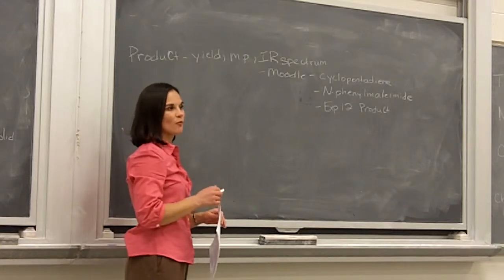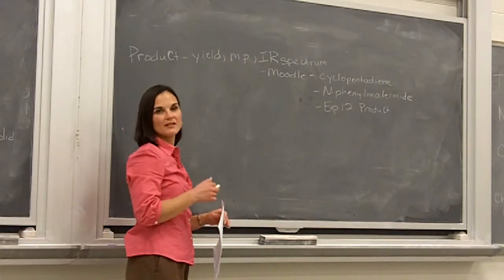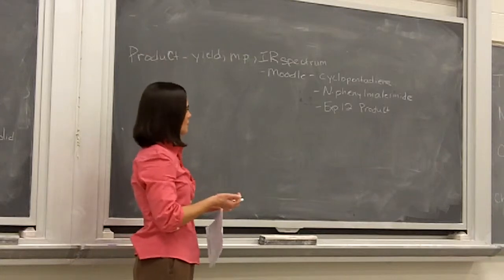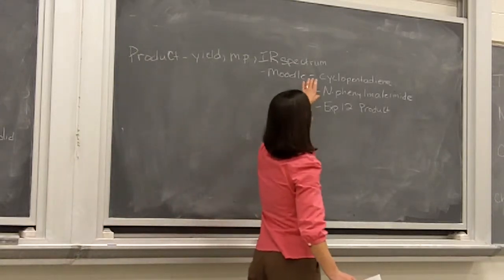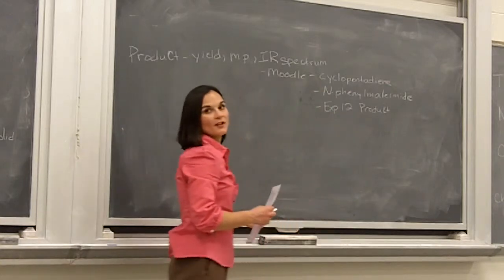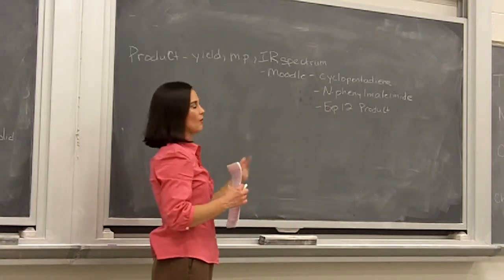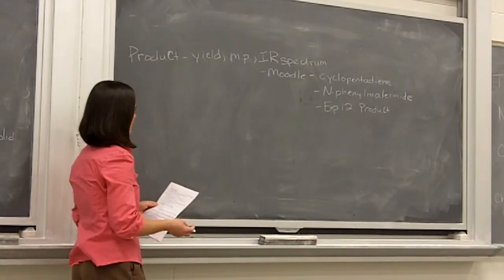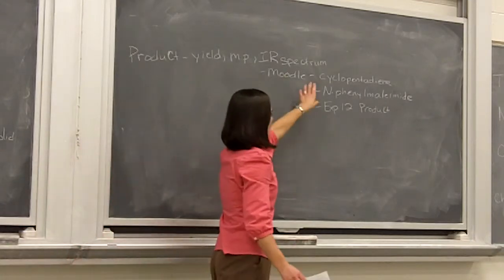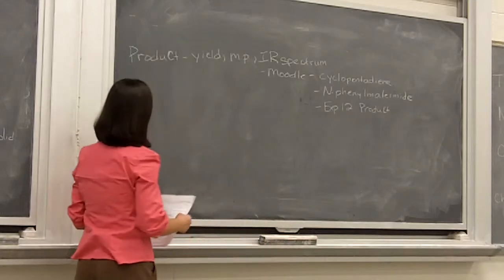Make sure that what you are listing are possible peaks in either your starting materials or your final product. There sometimes are impurities present that don't necessarily correlate with either your starting material or your final product. So make sure what you list in your table makes sense. And then compare all these for your IR analysis.